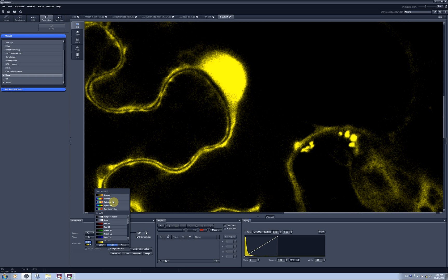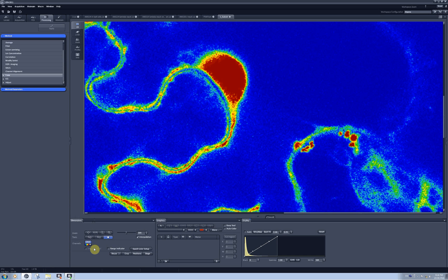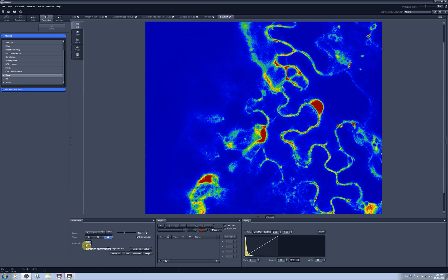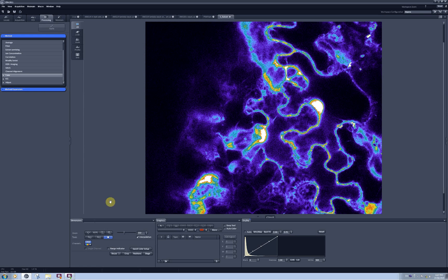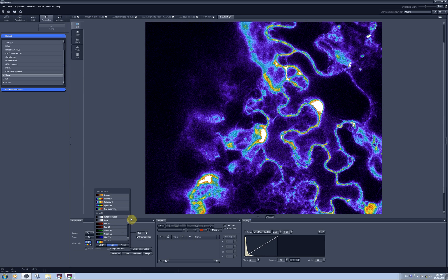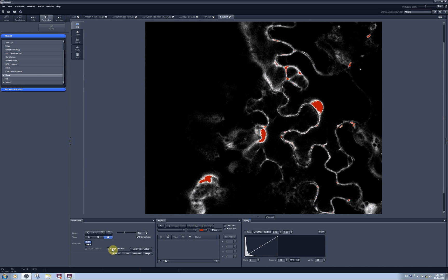There are single color codings available, or more sophisticated tools available in the lookup table. For example, there is a Rainbow tool which is quite useful if you want to show differences in intensities on your image. It codes pixels with low intensities as blue, slightly higher intensities as green, even higher as yellow, and the highest intensity pixels as red. There are different rainbows available giving different intensity ranges, and you can find more by scrolling the scroll bar.